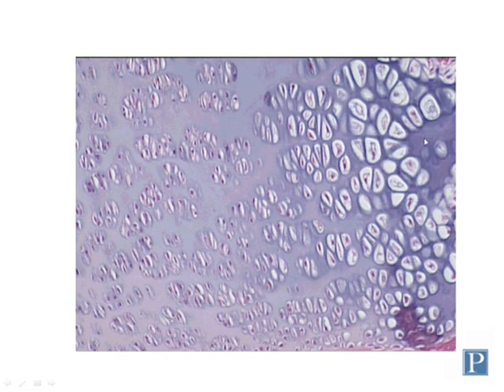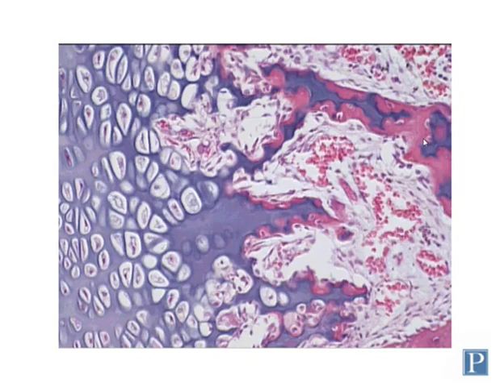Even closer to the diaphysis of the bone, close to where new bone is being laid down, you have another zone which is called the zone of calcification and cell death. It appears when you see a change in coloration of the matrix from a lighter basophilic color to a deeper, almost more purple basophilic color. That's because the chemistry of the matrix is beginning to change in this particular area. Here you can see the transition between the zone of hypertrophy and the zone of calcification and cell death.